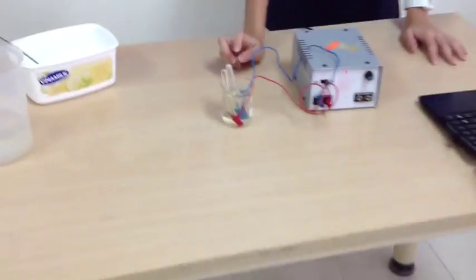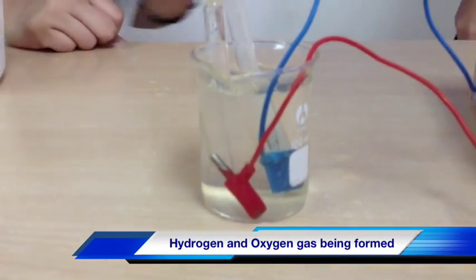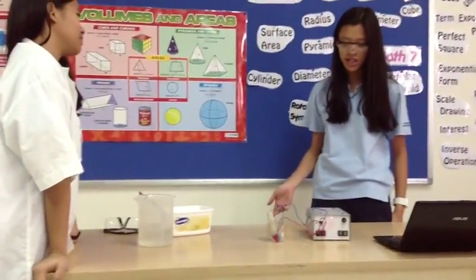Now we will put the positive charge and negative charge into each of the test tubes. Then there's hydrogen and oxygen gases forming, and that's why there's bubbles. So this is our experiment to show decomposition.